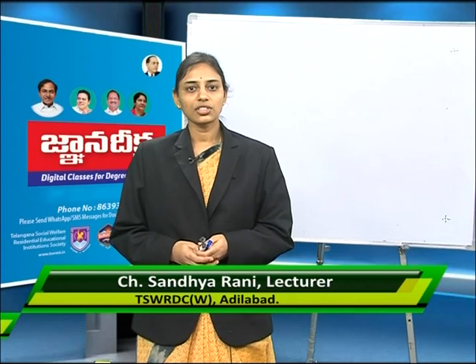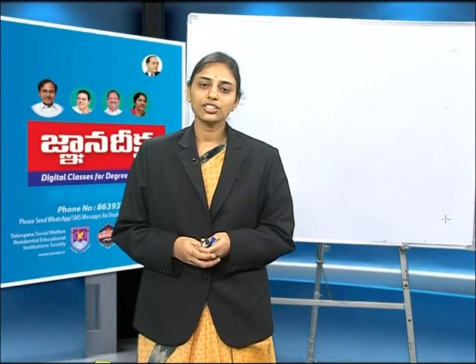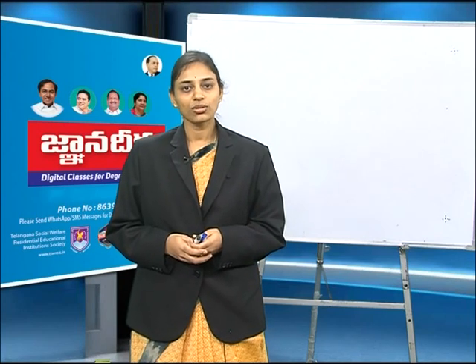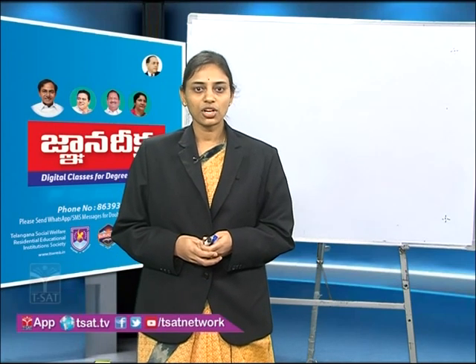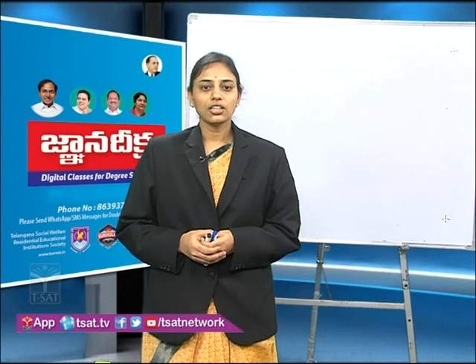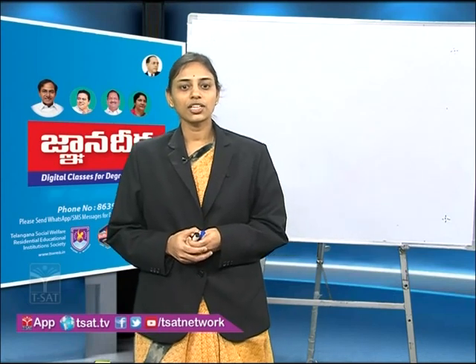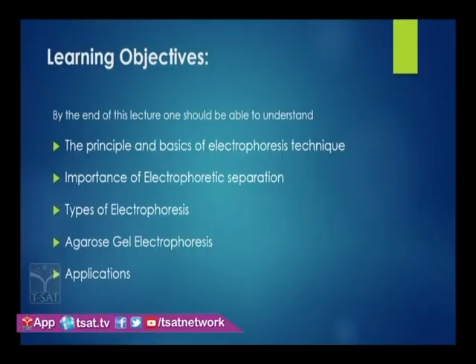Today I am going to discuss a technique which has wider applications and is also one of the most popular and routinely used laboratory techniques. The technique which I am going to talk about is electrophoresis. In this session, we are going to learn about the principles and basics of electrophoresis, the importance of electrophoresis and the types of electrophoresis, in which I am going to emphasize Agarose gel electrophoresis and its applications.